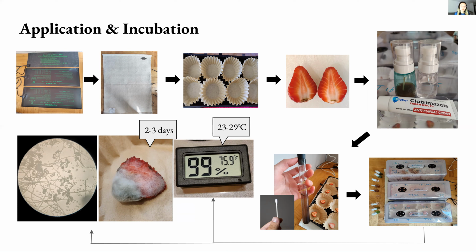After 30 minutes incubation at room temperature, each strawberry was inoculated with fungal spores using a mixture of tap water, mold spores, and soil from my backyard. I dip a Q-tip in the dirt water suspension and wipe across the cut surface of the strawberry halves. Then I cover the seedling starting pan, with the inoculated and treated strawberries sitting centered on the coffee filter, at temperatures of 75 to 85 degrees Fahrenheit, which is about 23 to 29 degrees Celsius.